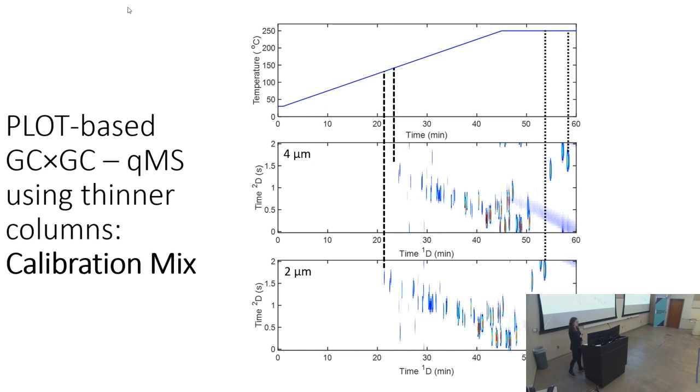And just to drive this across, before, when we went from 30 meters to 5 meters, we pretty much went from a 50-minute separation to a 15-minute separation.